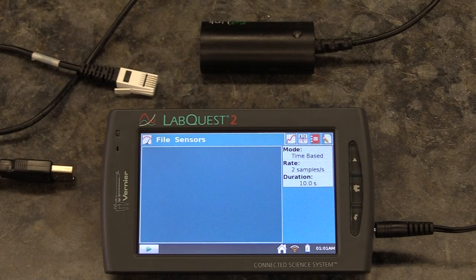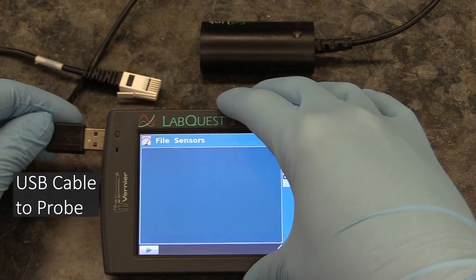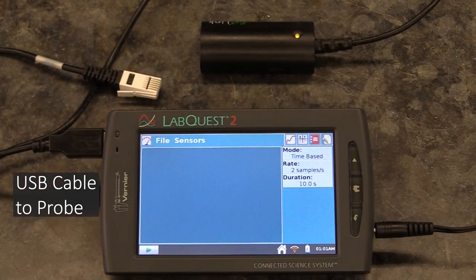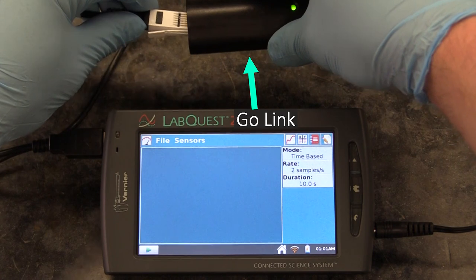Once it has, you can plug the pH probe's USB cable into it. On some models, you'll plug the probe into a Go Link that plugs into the computer by USB.